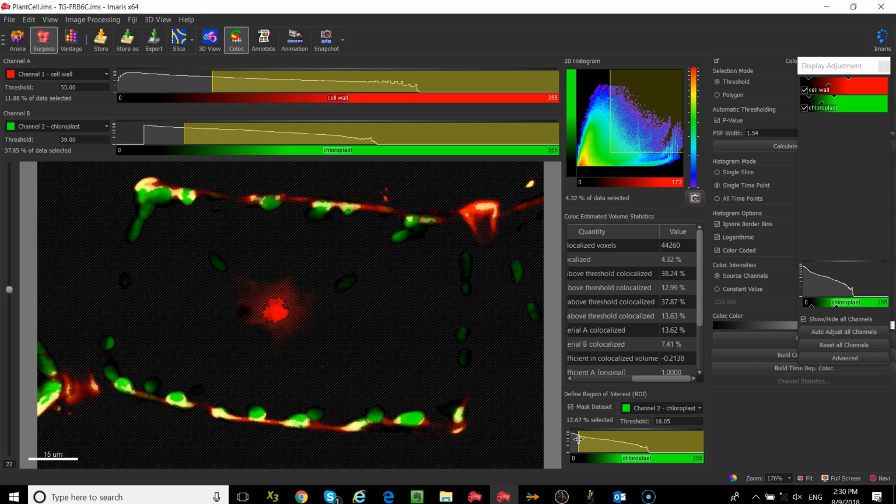Okay? So once you have done that, over here you have a breakdown of your colocalization statistics. All of these are detailed in our reference manual. There is also a colocalization tutorial on our website, so you can go in and see how this is all done. But one thing I wanted to show you is that it will give you a breakdown of the percentage of colocalization within your region. Now, your region of interest is the unhatched area. Okay, so right now I only have like 4% or something very small, which doesn't surprise me. This isn't a true colocalization data set.